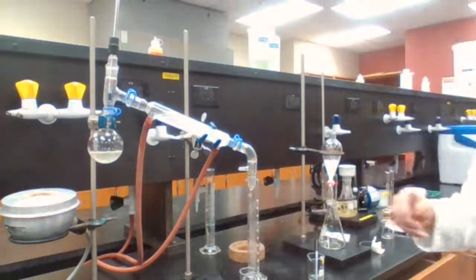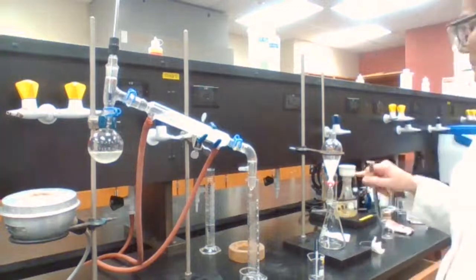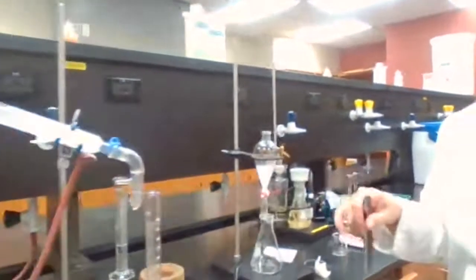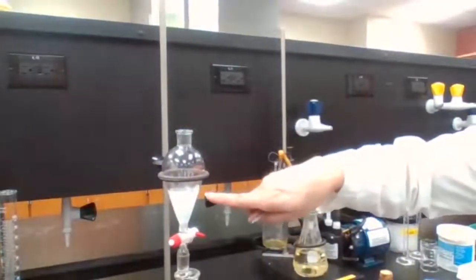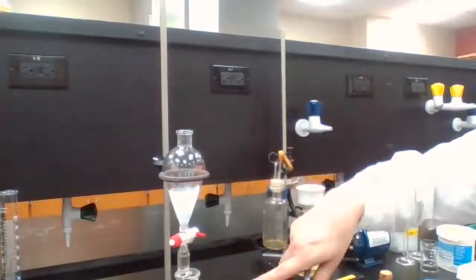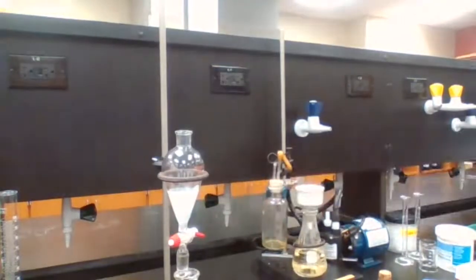To make it easier for drying the sample for the next step, I'm going to add some sodium chloride, but if you look closely, the two layers have been separated, and now you can take your second screenshot for the setup, and that's for the distillation. You can take your screenshot.